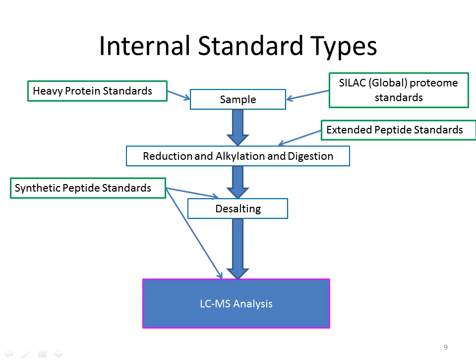And then synthetic peptide standards, this is the actual analyte you're going to measure. You spike it in pretty far down the workflow, and it doesn't take into account a lot of the variability preceding it, but it is pretty much the analyte that you're measuring.